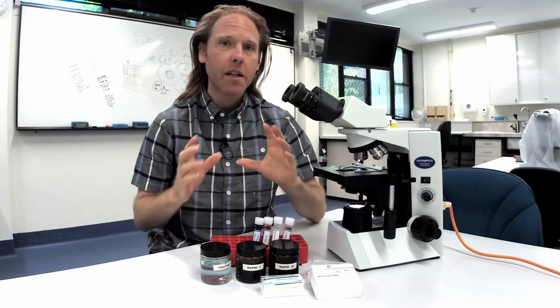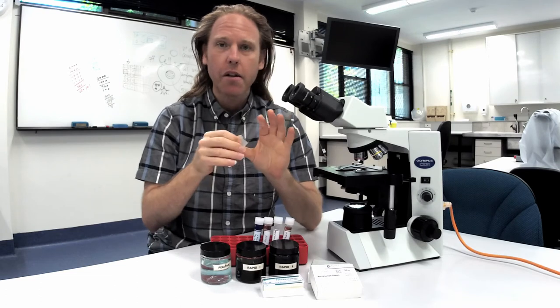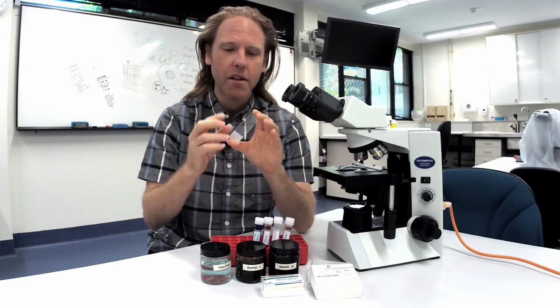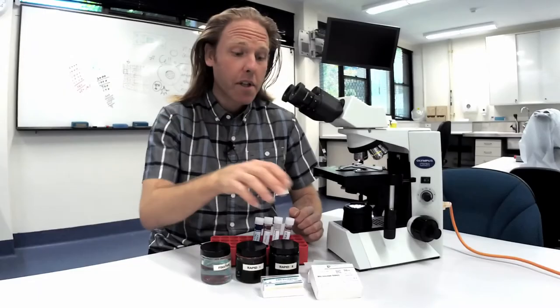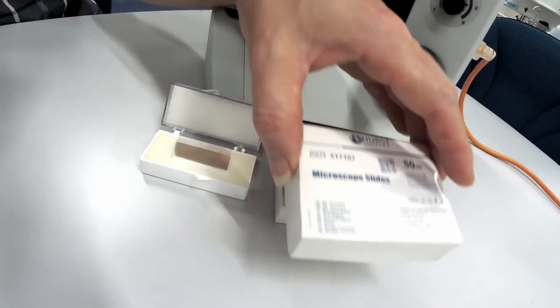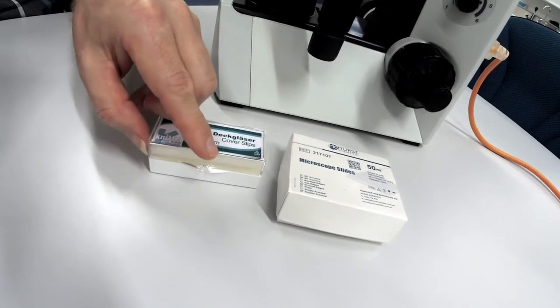How you handle your slides makes a big difference to sample quality. Try to minimize handling so you can avoid artifacts like fingerprints and squames from your fingers accumulating on the slide. Keep slide boxes and cover slips covered when you're not using them. Dust builds up very quickly and really interferes with sample quality.